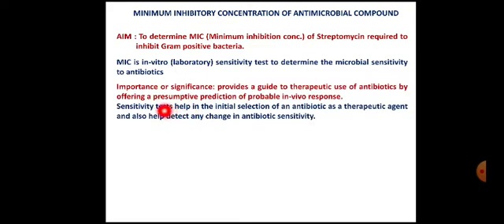What is the significance of this MIC? Determination of MIC provides a guide to the therapeutic use of antibiotic by offering a presumptive prediction of probable in vivo response.